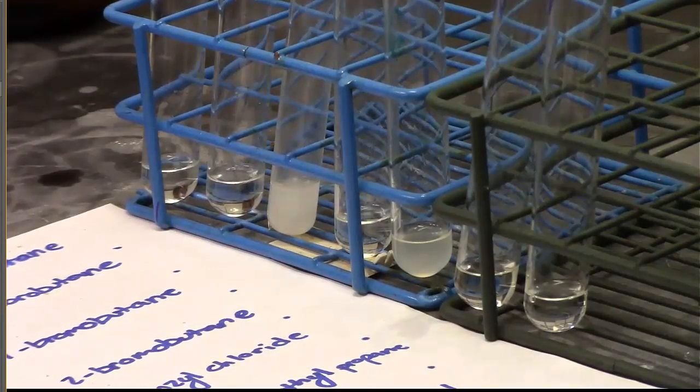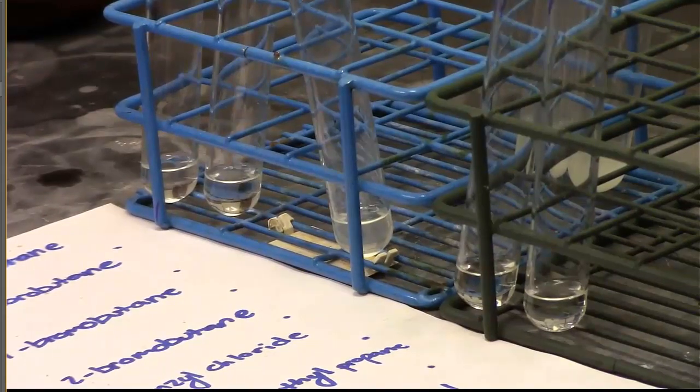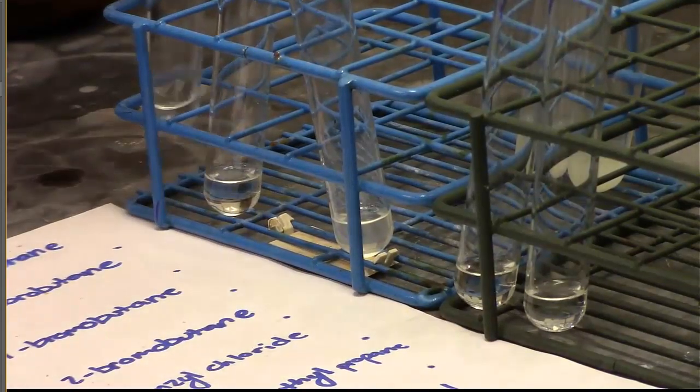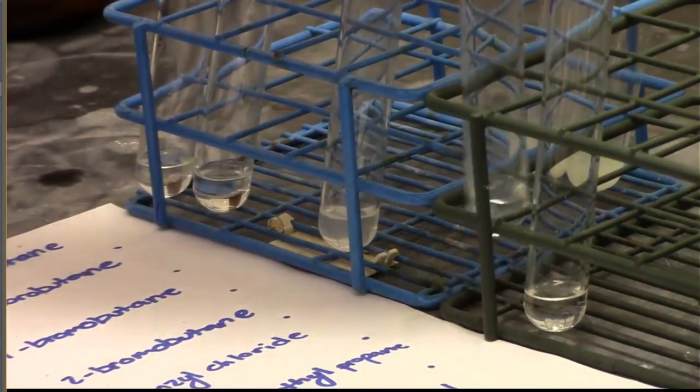Looking at a close-up view again, it looks like our 1-bromobutane was definitely the fastest to react. It went almost instantaneously, but for having some substantial precipitate in solution, we'll say that was about 10 seconds after adding our strong nucleophile, and our benzyl chloride also. So we just clipped that out. It looks like not a lot happened. So that was essentially 8 minutes of the reaction.